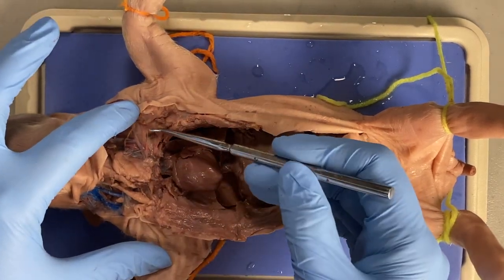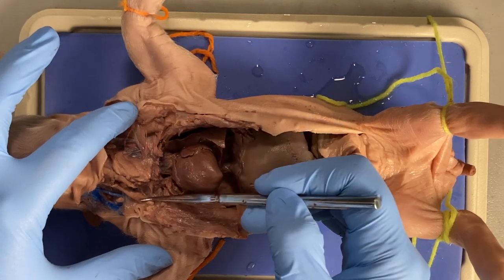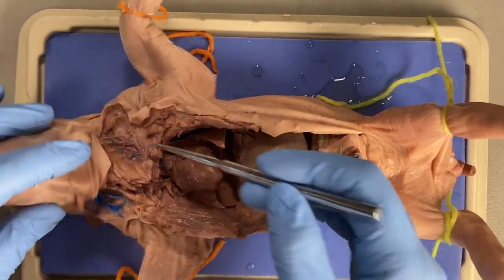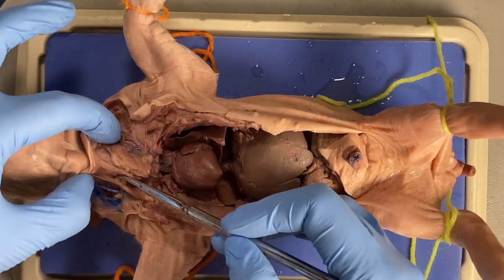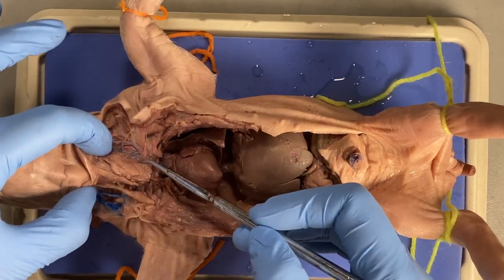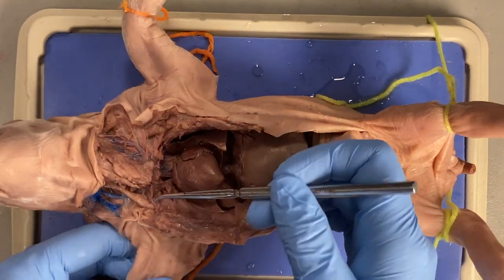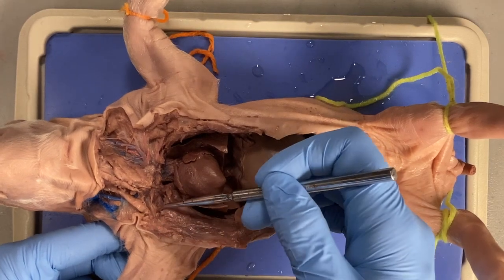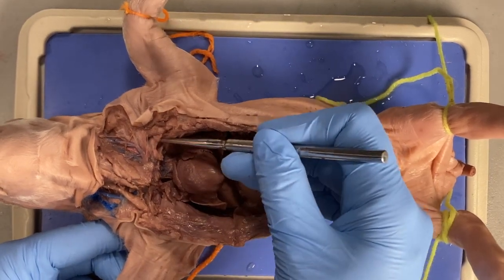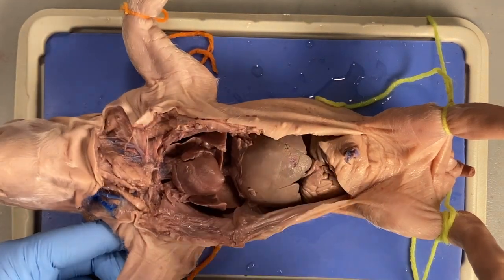We are interested in the blood vessels that go out to the arm and up to the head. I'm going to do my best to keep the stuff in this area intact because we'll be studying that in the next few weeks. But what I need to do is see if I can find these blood vessels going out to the arm and up to the head.